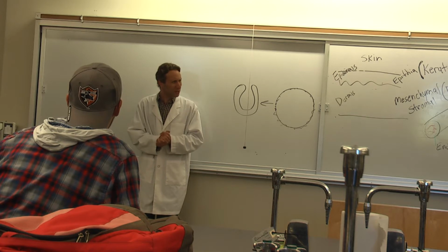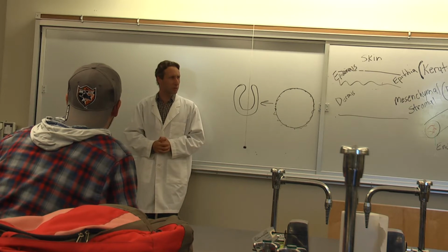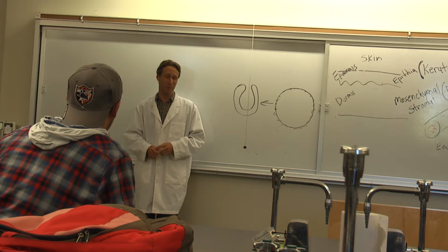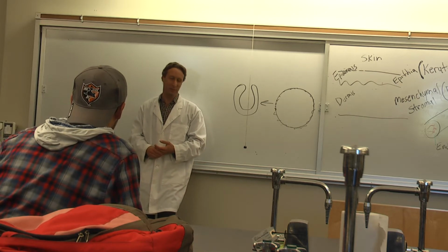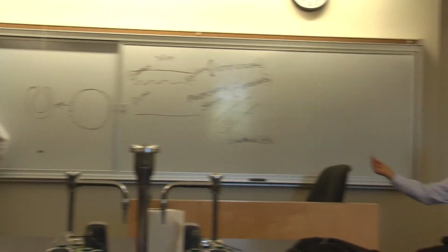Okay. The materials you guys use aren't particularly dangerous. One thing is that your lab is a little bit congested, a little bit crowded. So try not to get yourself blocked into a bad place where you can't get out. Here, there are exit areas all over the place, but keep that in mind. Make sure that in the lab room, you know where there's a way out. In every room, there's supposed to be two exits.